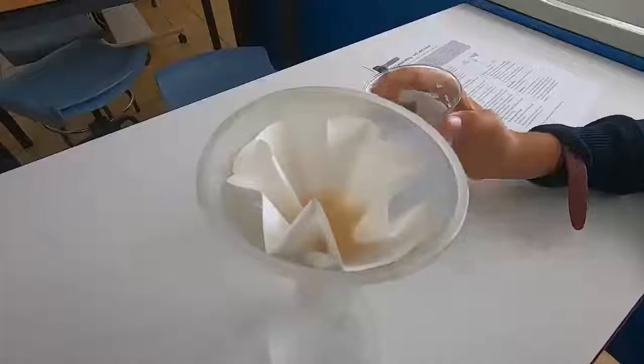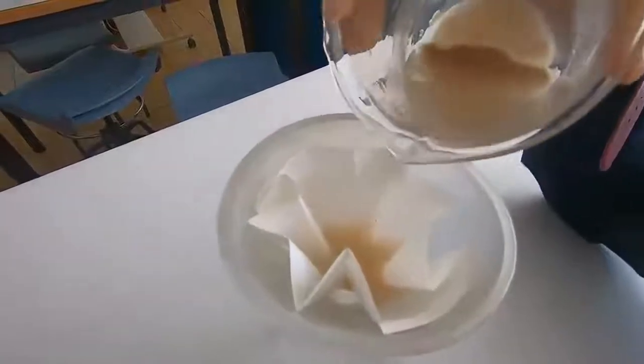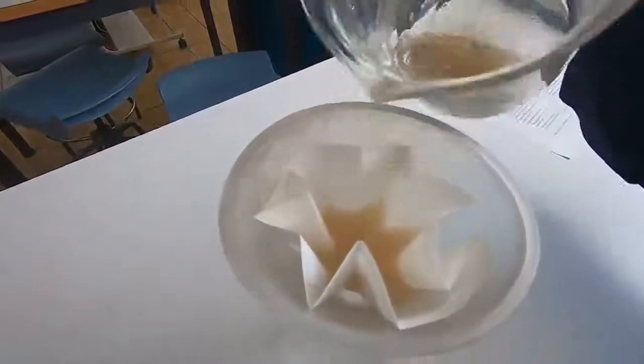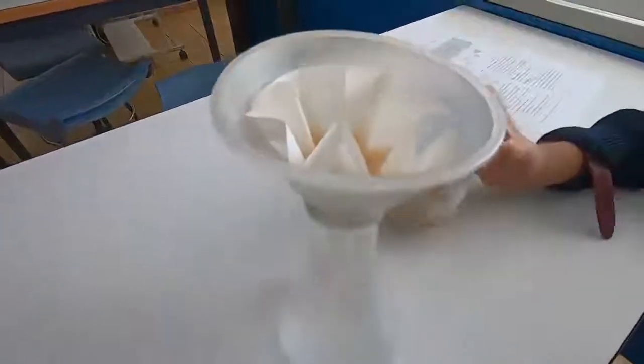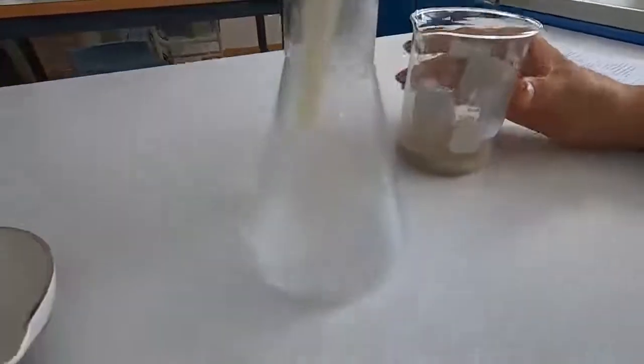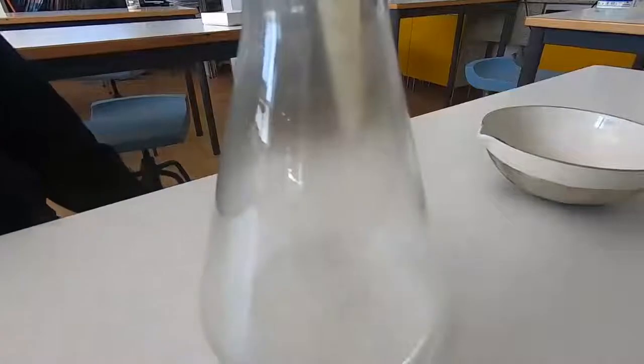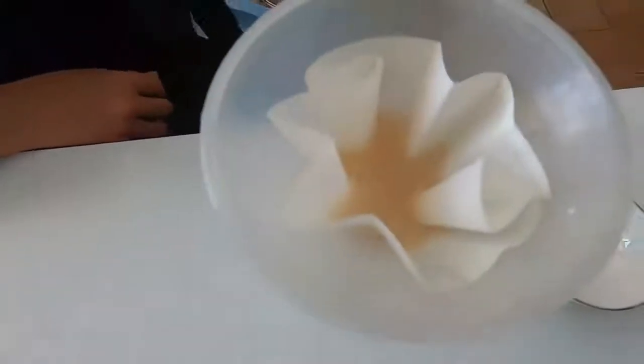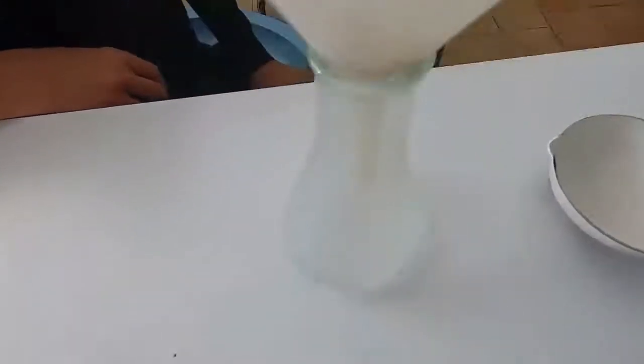A little bit of condensation appearing inside the conical flask as the liquid is still quite warm. We're collecting the filtrate in a clean conical flask and that's what we're going to be using for the next part of the experiment. This is what's left — the sandy mixture that didn't go through the filter paper, and there'll be some on the filter paper as well.